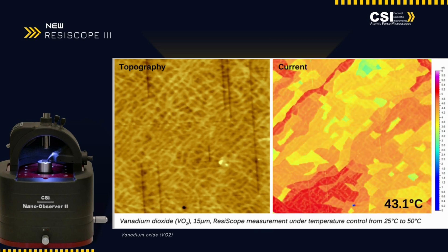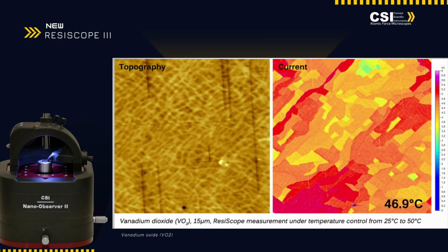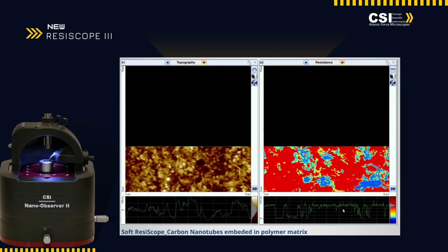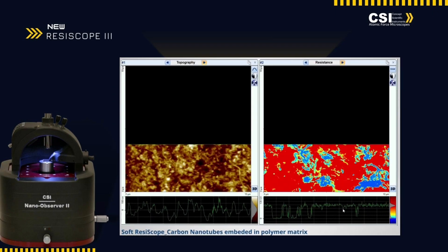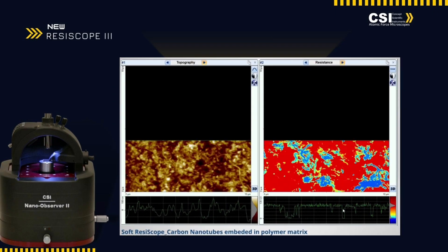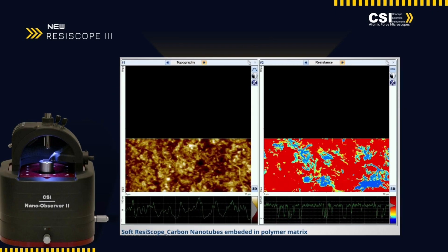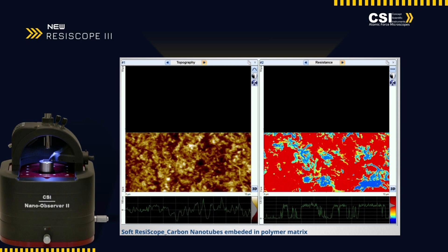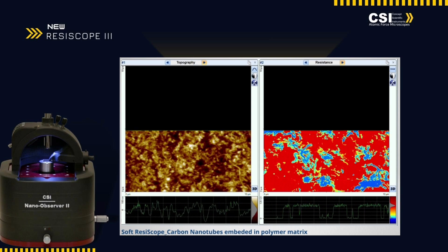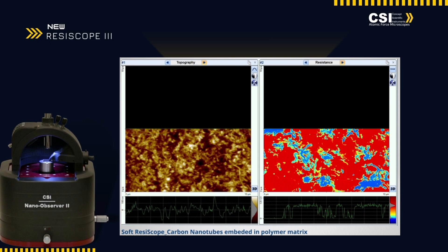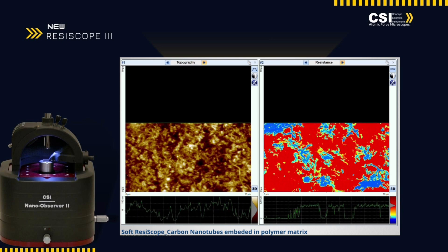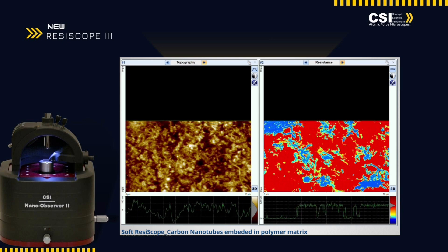This showcases the dynamic responses of vanadium dioxide as it transitions through its phase change temperature. As you can see in the video, our Resoscope's advanced electrical mapping capabilities provide a detailed analysis of carbon nanotubes embedded in a polymer matrix.